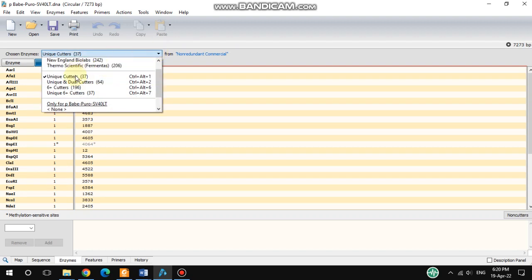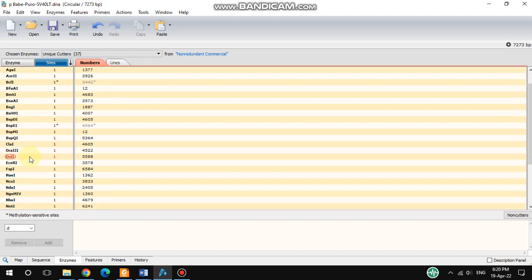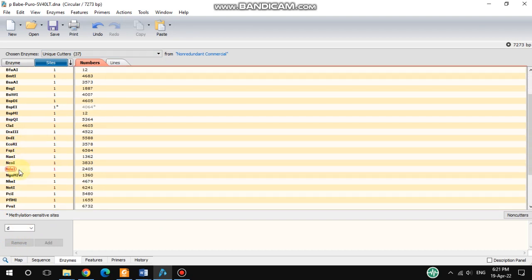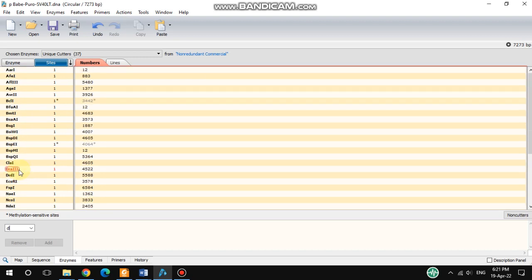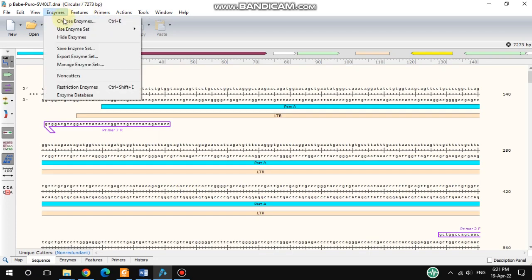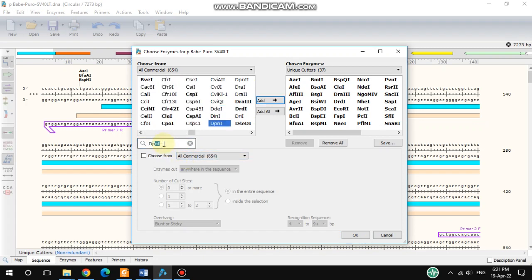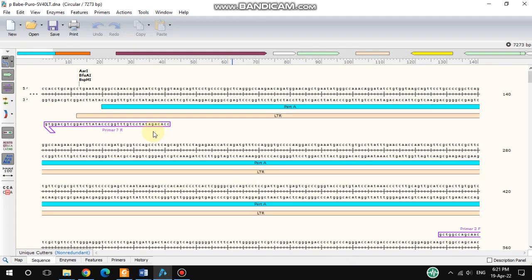If you choose any enzyme from here, there are unique cutters available. For example, if you search for DPN1, you can find it here. DPN1 may not appear in the default list, but you can add it — just type DPN1, add it, and all the added enzymes will appear.